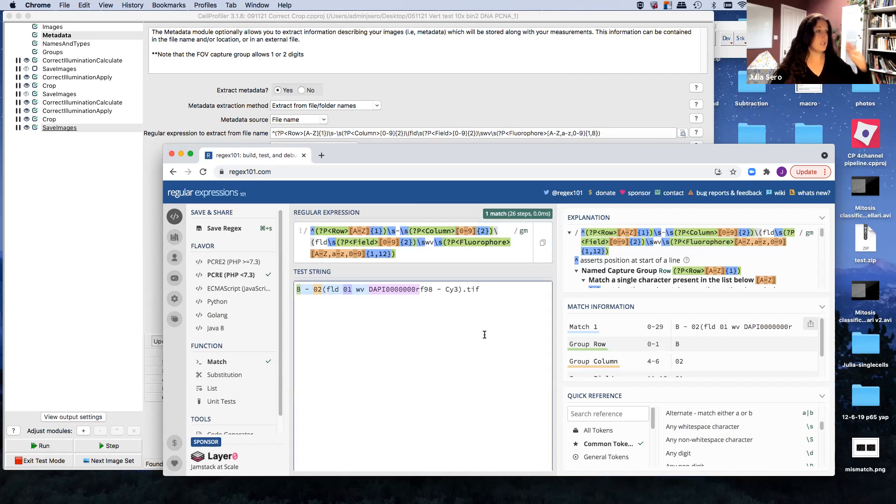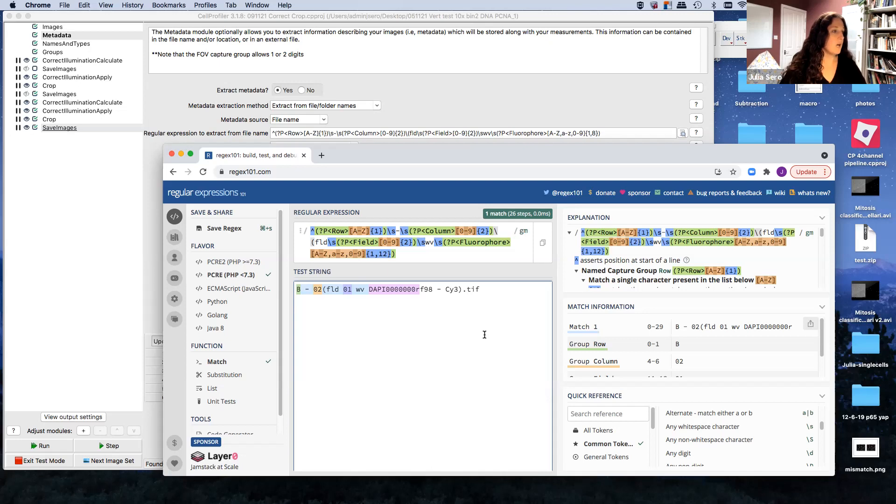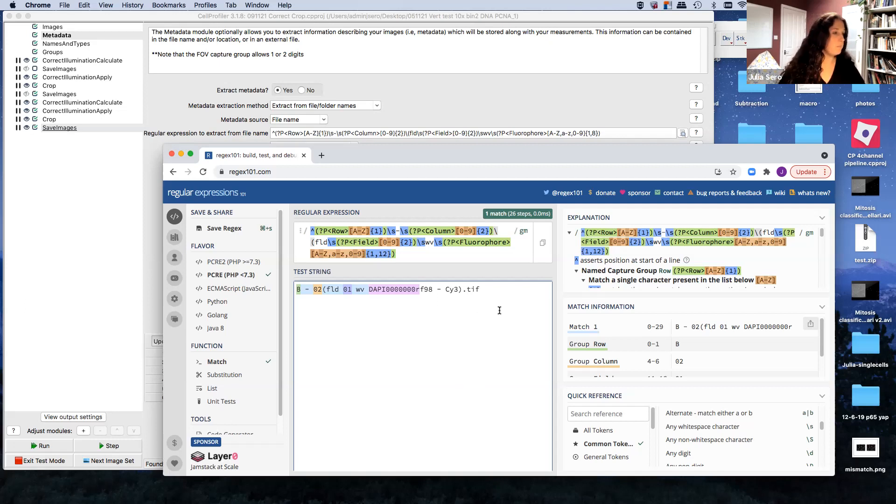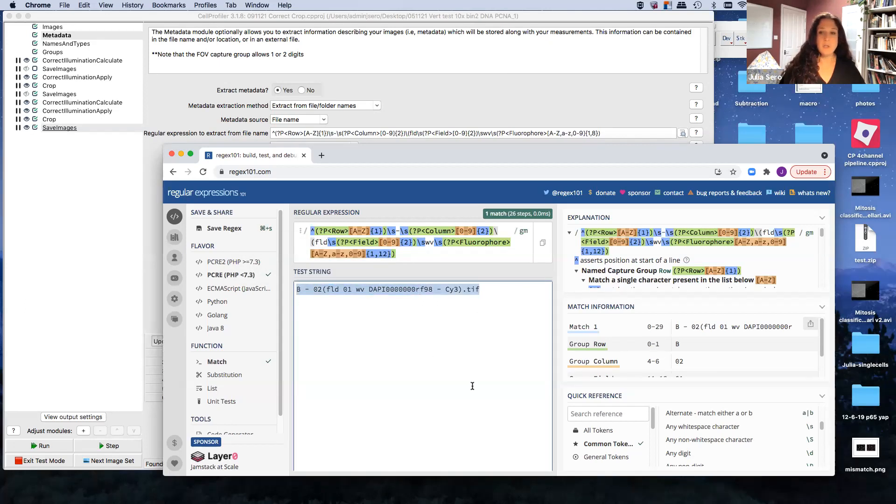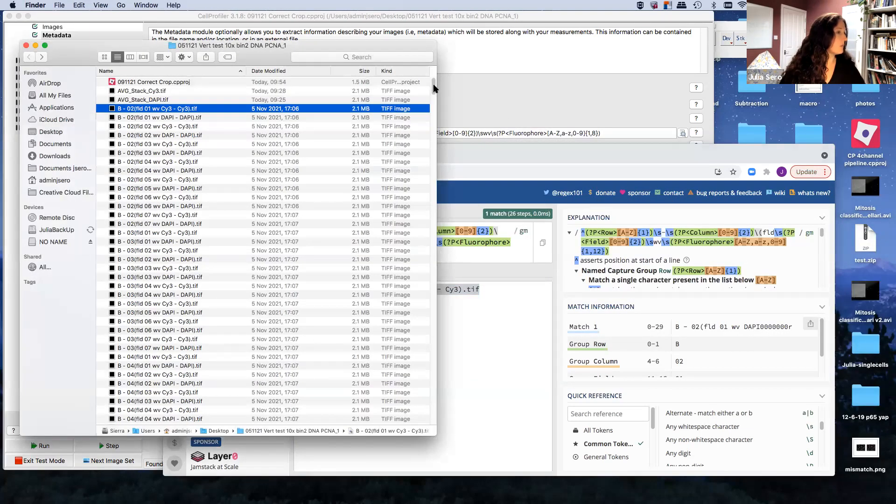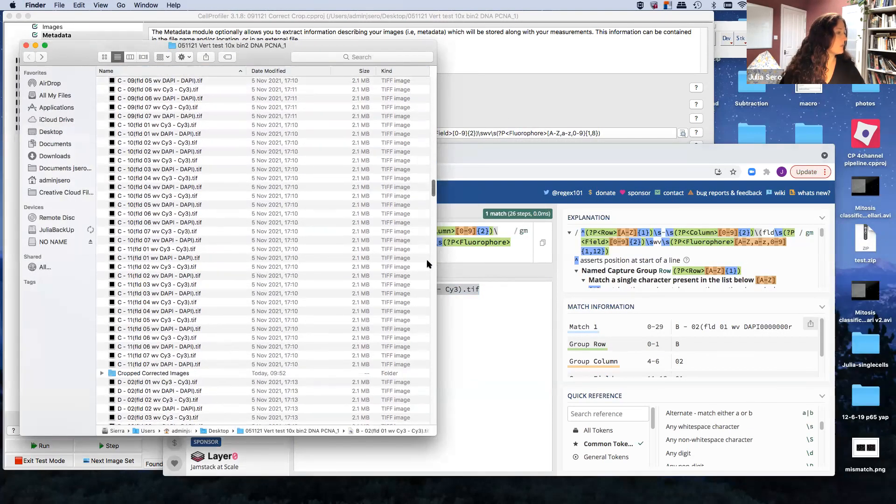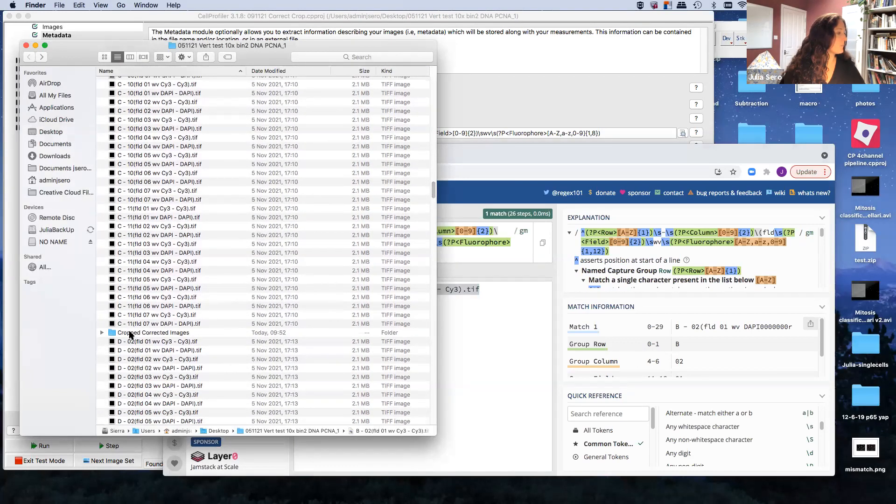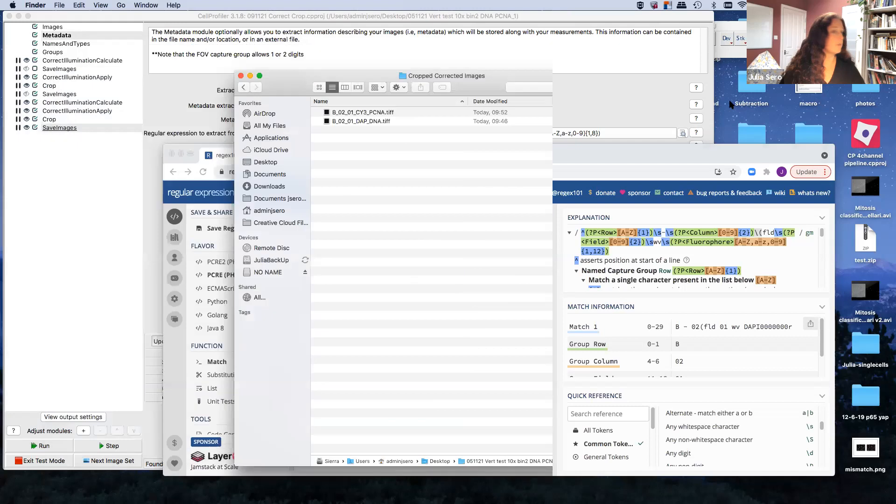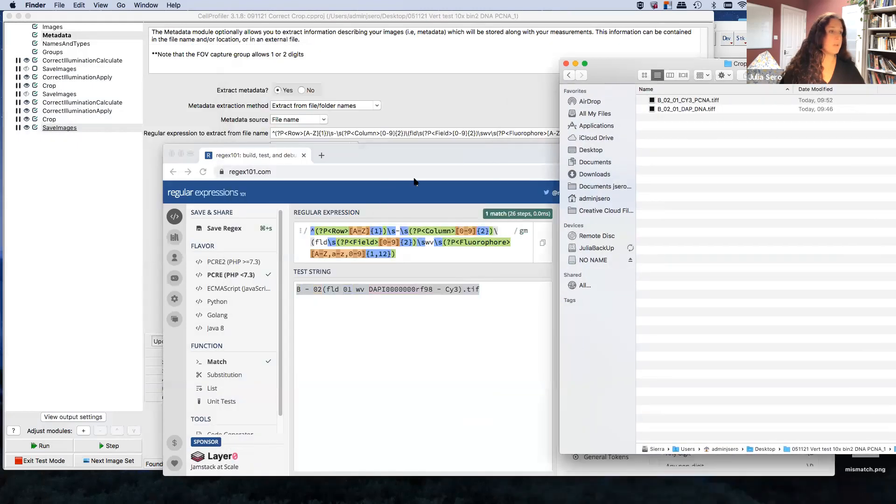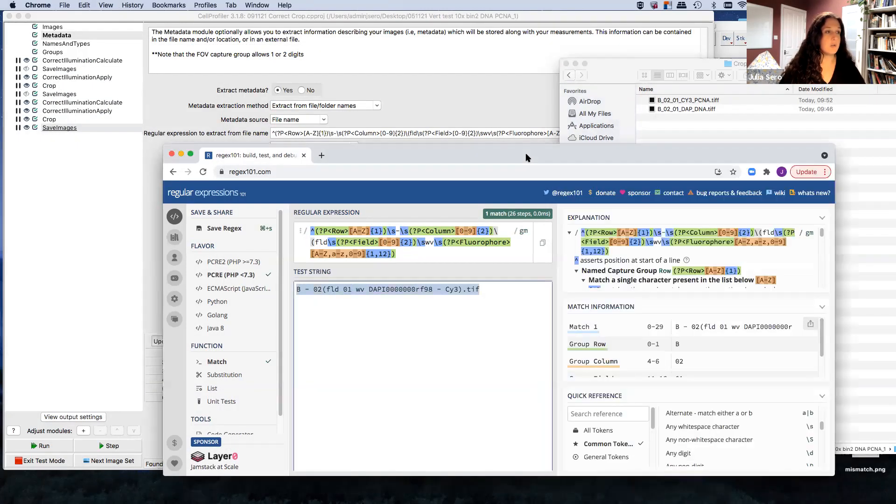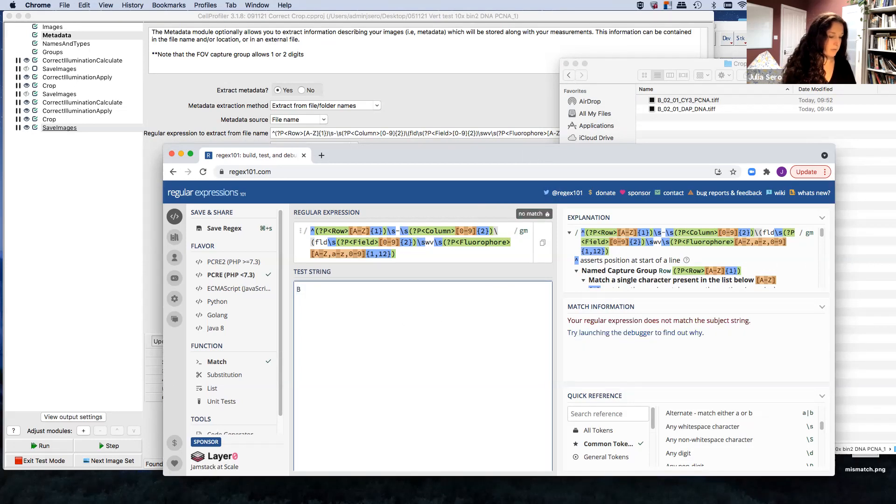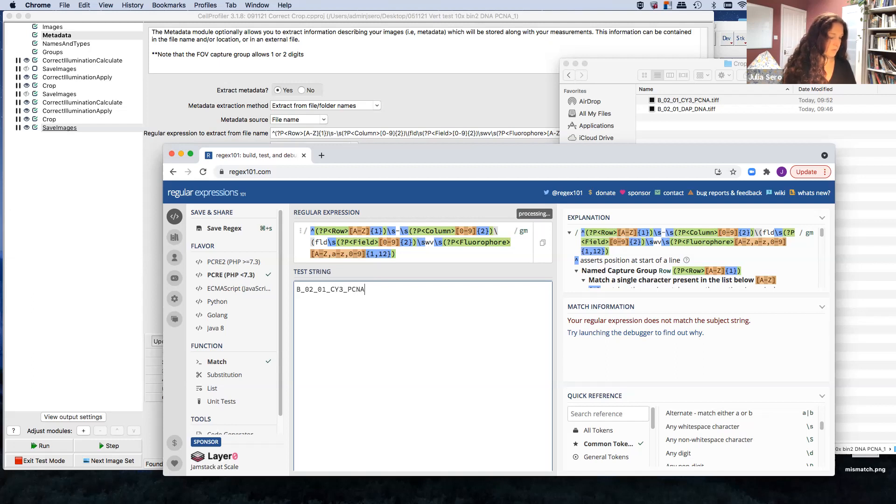So this regex tester is super helpful for extracting metadata. So I said that when we save our images, our cropped and corrected images, we could save them as whatever we wanted. So I've given them names that I think are easy to use, more easy to use than these. So let's try those and make a regex of them, because you will need that for your subsequent CellProfiler pipelines.